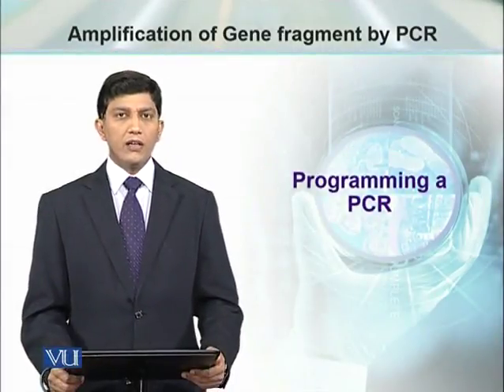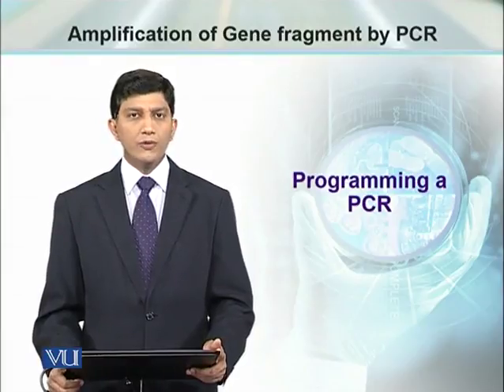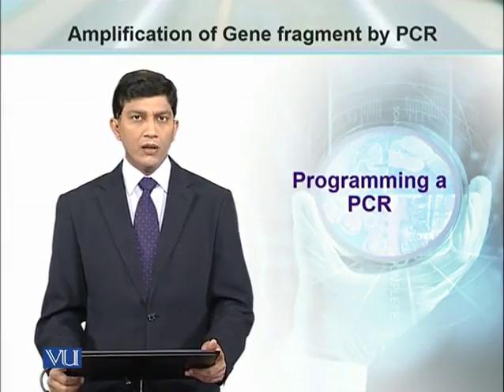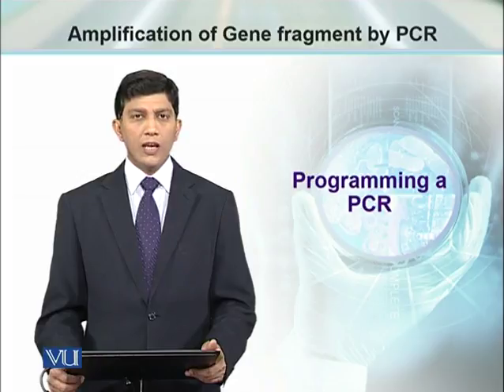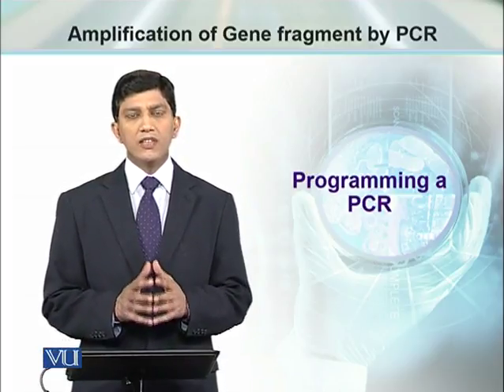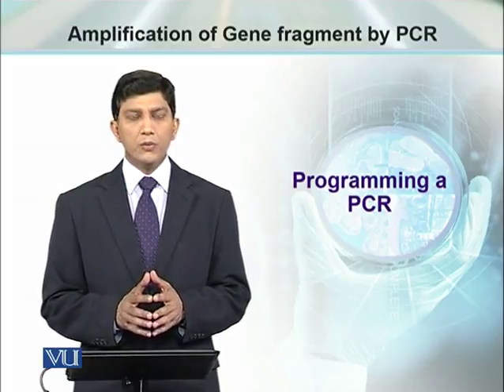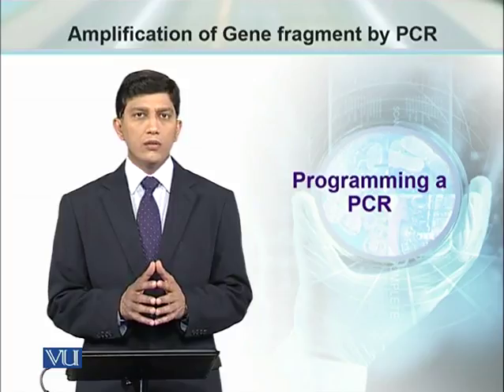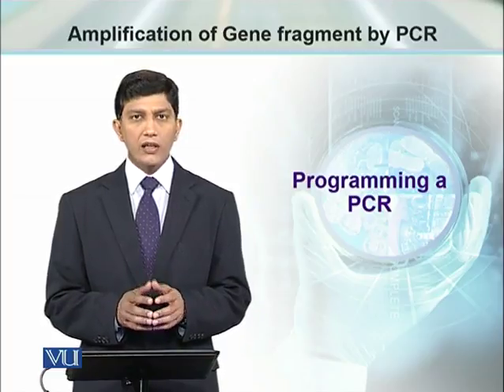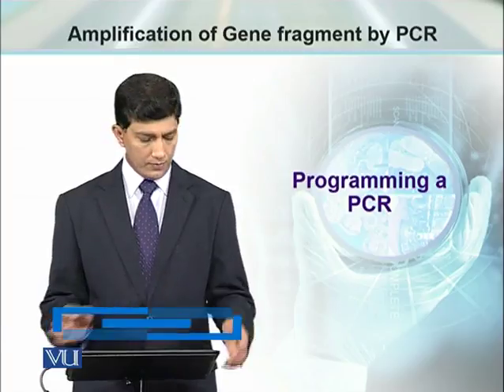Before we can start this procedure of PCR, we have to do some homework. In order to amplify any DNA segment using a set of primers, we have to find out the temperatures. We have to work to find out the number of cycles required. This is referred to as programming of PCR.